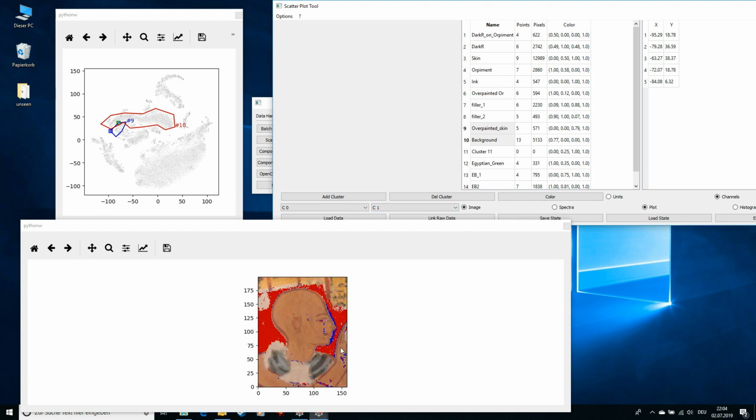And this is because the face was originally painted further, stretching out, and then after it was painted, limited again by the application of white paint. There's no reflectance from the red paint under the surface still detected, but the much more penetrative X-rays go down there.